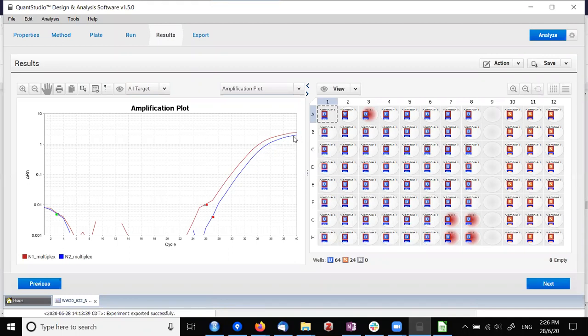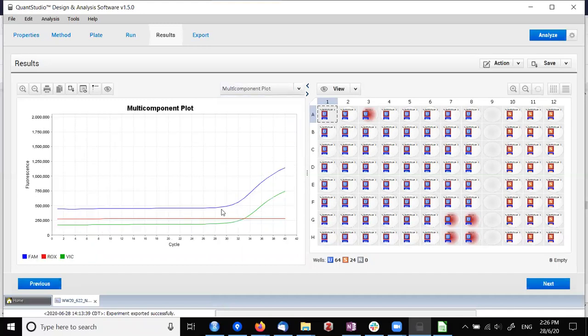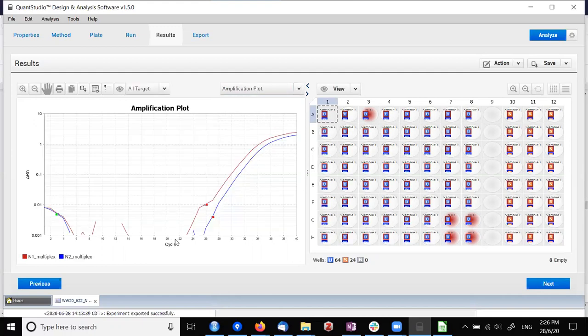So another way you can do it is if you analyze this curve. This is actually processed data, but the raw data looks like this. So this is the fluorescence that the machine is measuring, and it increases at some point. It does background subtraction on this raw data, and it gives you this weird thing. And they use proprietary algorithms, so we don't know the maths behind this final curve.